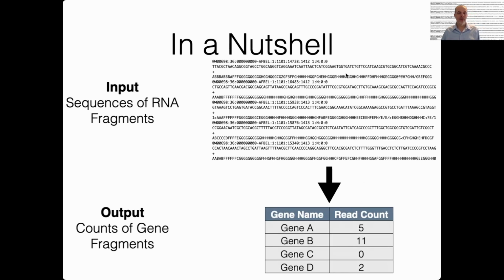So basically, if you fall asleep for the next 2 hours and 40 minutes, this is what we're doing today: going from here to here. I'm going to talk about why and how to think about this, and we're going to do this hands-on. But this is basically our goal for today.